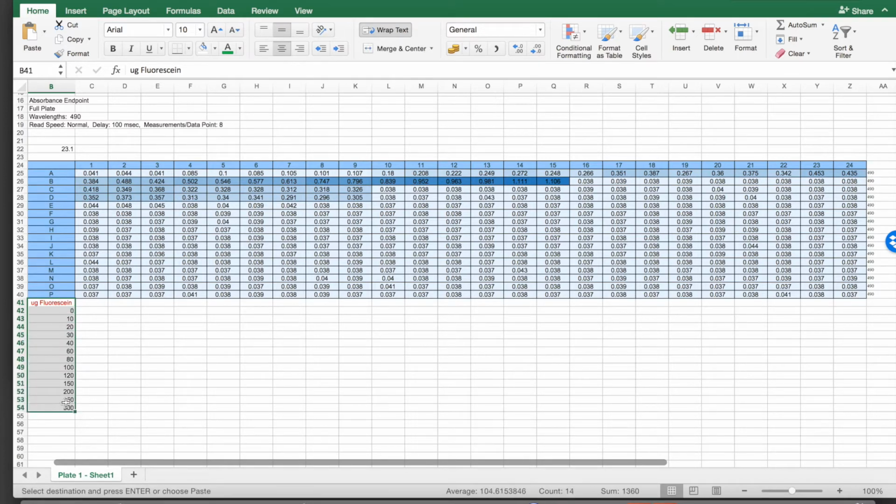So first I want to do the standard curve. What is the standard curve? What I get here is absorbance data, correct? Any solution has an absorbance to light, correct? In the case of our samples, they were yellow, and the brighter this yellow, the more light they would absorb from the instrument. So here all I have is the numbers of absorbance. That means nothing in terms of microbial activity.